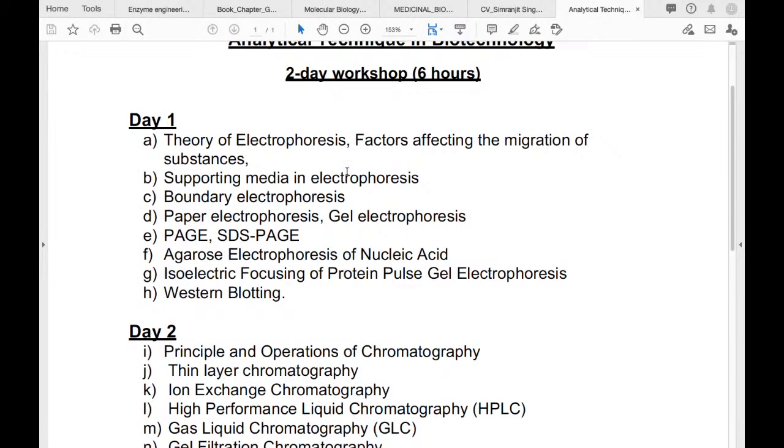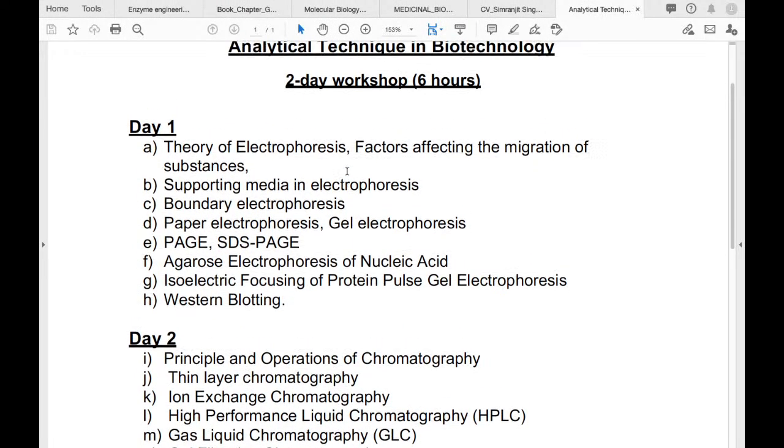So in this, we will be dealing basically with today's topic, electrophoresis.